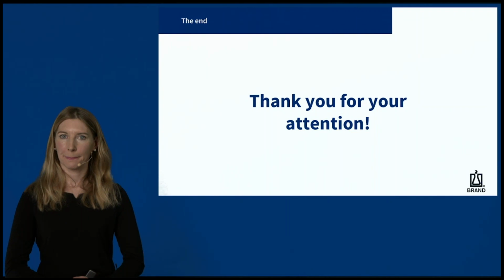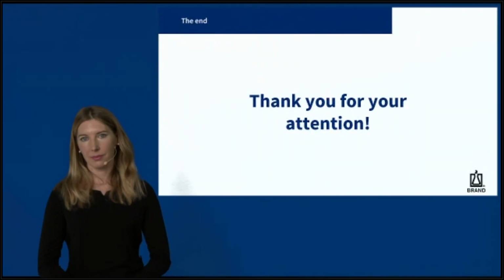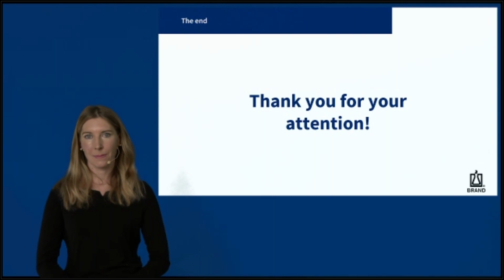Thank you, Mariella. Another question from Sebastian. If I have critical samples which should be dispensed in the laminar flow hood, can I use a small liquid handling robot, or do I need another system?